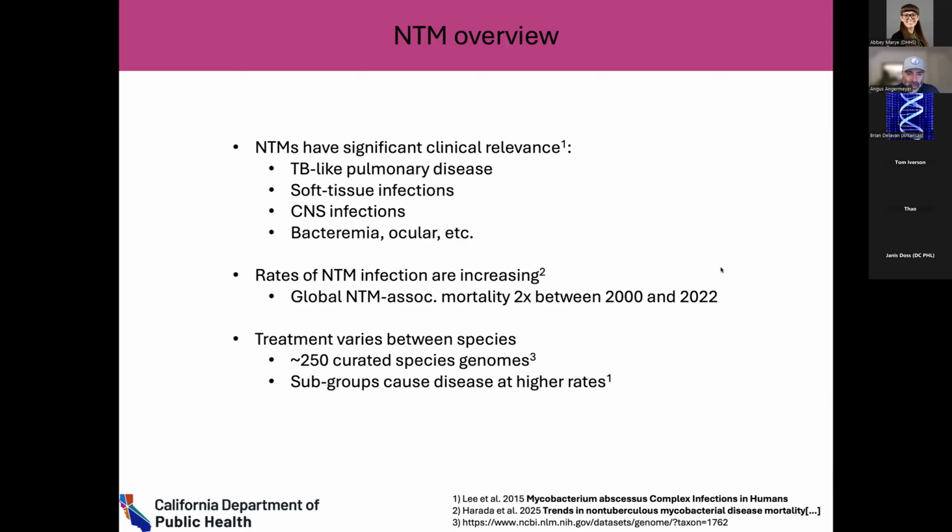In California, I think they're seeing many more clinical infections as well. So we need to find a way of quickly sequencing the cultures they get from the clinics, analyzing what they could be, and getting that information back to the clinician soon enough so that they can actually put in place some of the treatments.